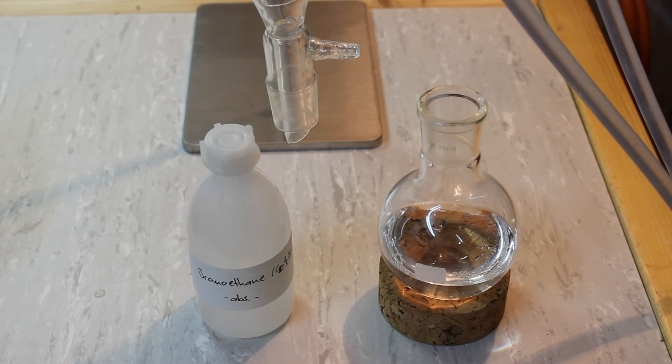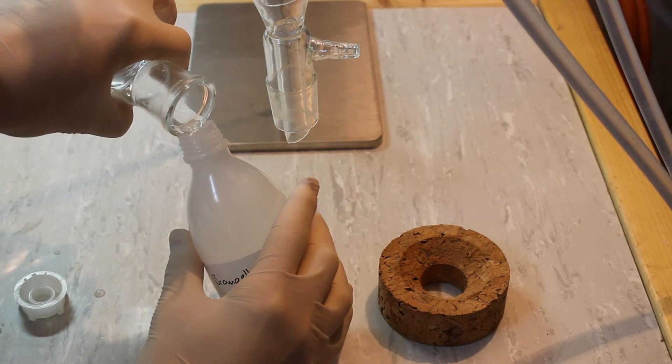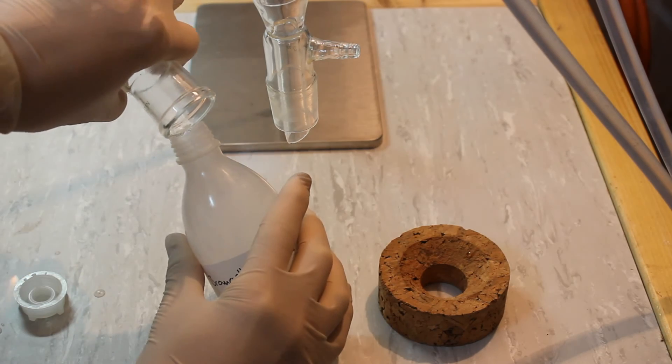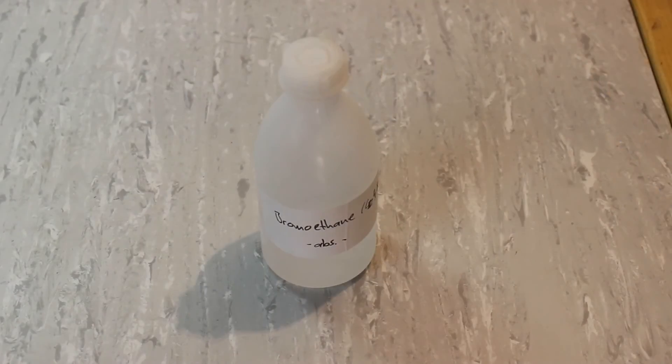Here's our final yield of very dry Bromoethane. I'm now going to transfer it into a properly labeled storage bottle. I'll be using this in an upcoming video to perform a Grignard reaction, so stay tuned for that.